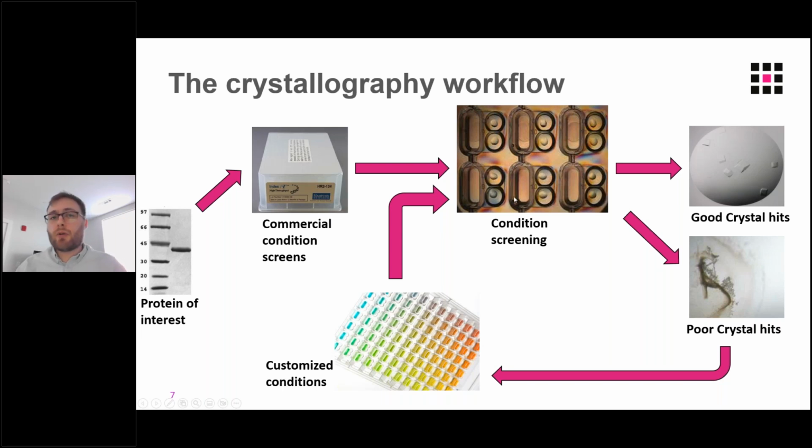So as I mentioned, all of this can be done by hand, but protein needs to be very concentrated for these crystal trials to work, and making enough protein and purifying enough protein to get to this point means it can be exhausted very quickly if you're only testing one condition per microliter. This is where the first instrument I'm going to talk about, the Mosquito Crystal 3, comes in.